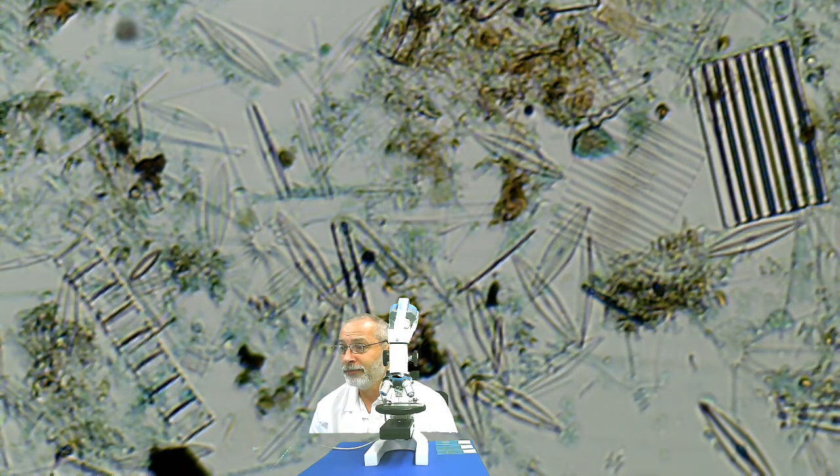And remember, you probably put some of these in your mouth every day when you brush your teeth, because these diatoms are these microscopic two-part shells that are put into toothpaste.